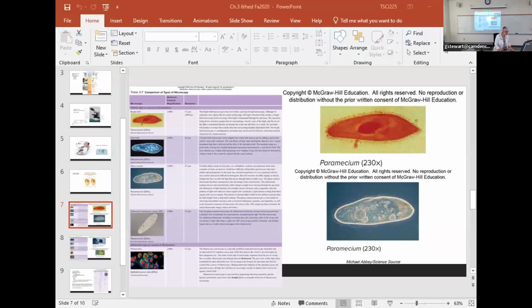All right, so my understanding is that we are in chapter 3. Yes? Okay. And I think I asked someone to write down, we talked about the different types of compound microscopes, true, false? Yeah. True. Examples of different compounds. And where we use them, right? And how we use them.